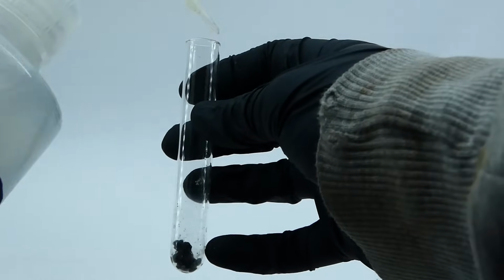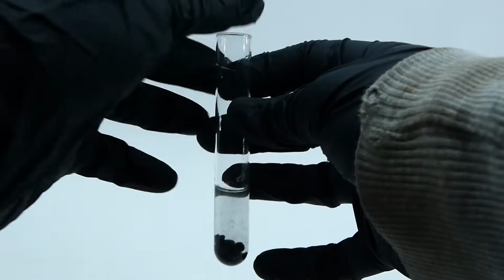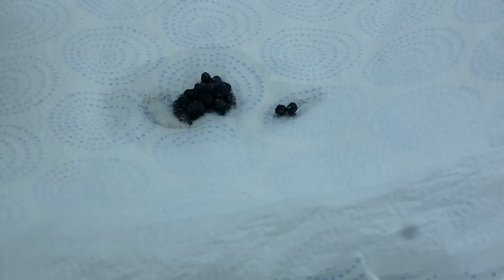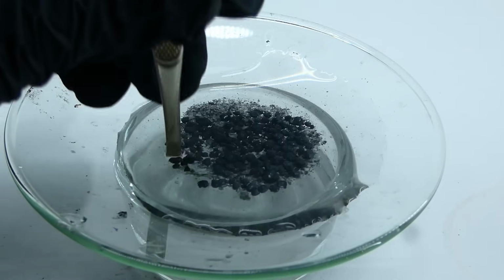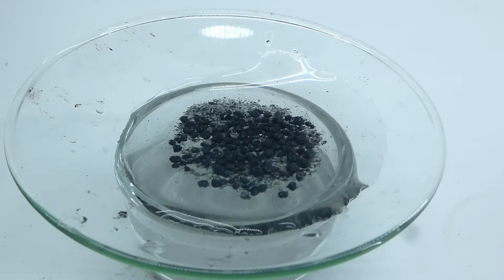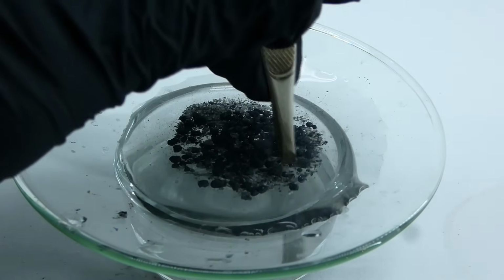To purify the beads even more, I washed all of the bigger ones using a test tube, which removed a lot of the aluminum oxide along with some of the silicon, but it wasn't too big of a loss, so I just proceeded to clean the smaller ones. It wasn't as easy as just using a test tube, and I had to soak everything in a good amount of distilled water, and then again handpick every single one of those little beads, which took forever, but in the end, I was finally left with some nice and clean beads of pure silicon.